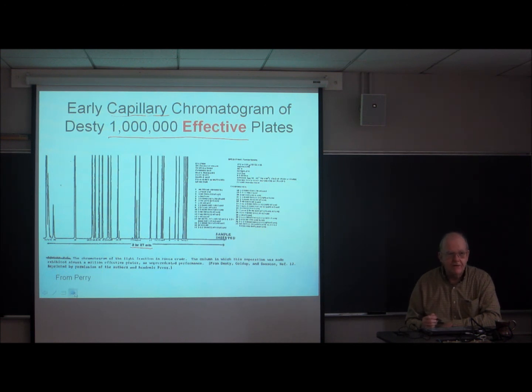GC, by the way, is still, in terms of dollars of instrumentation, about equal to liquid chromatography. And forget about the detector, just the instrumentation and the columns. It's considered a mature discipline, a mature subject matter. Most instrument companies that make them consider it a cash cow, because there's not a whole lot of new stuff going on in the GC world. So they're not putting a lot into research on it.